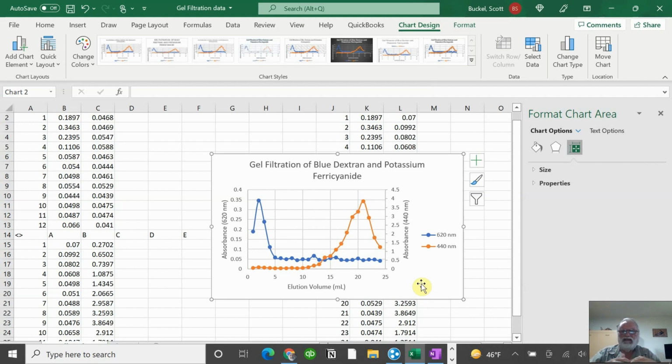And I want you to have just a couple of observations. Since we weren't able to have cytochrome C this semester, we're not going to write anything up about it, and we're not going to try to generate a standard curve or anything like that.